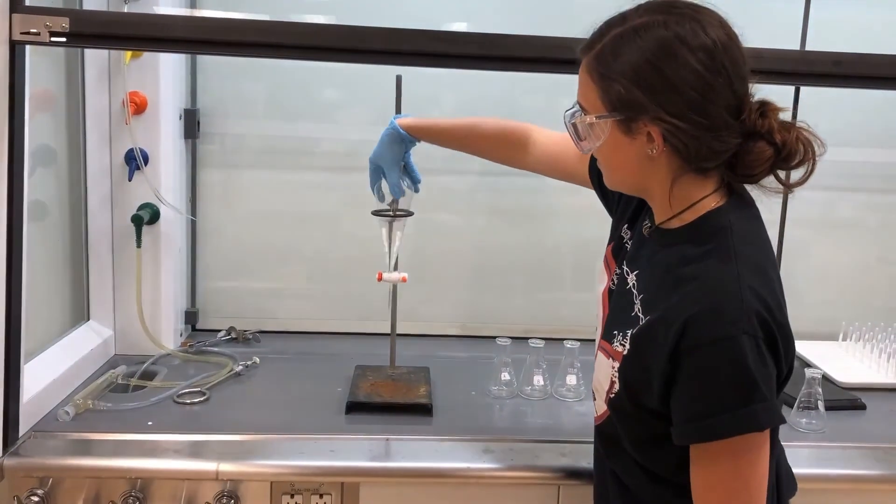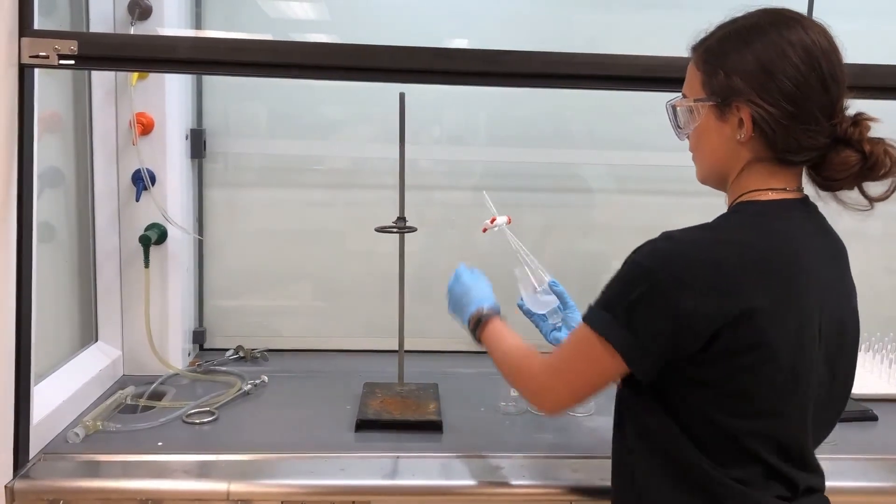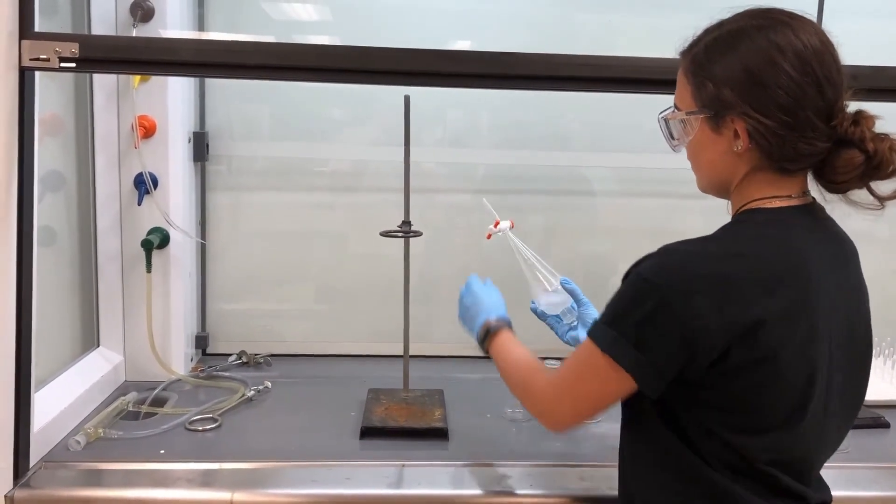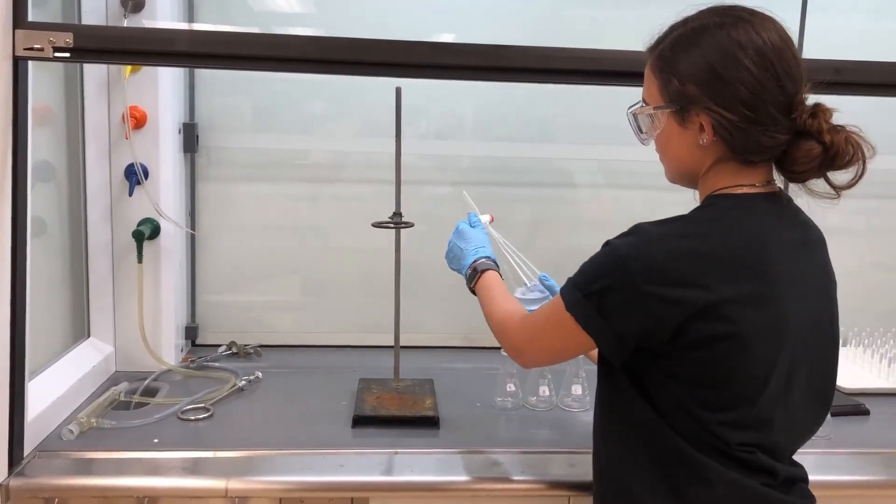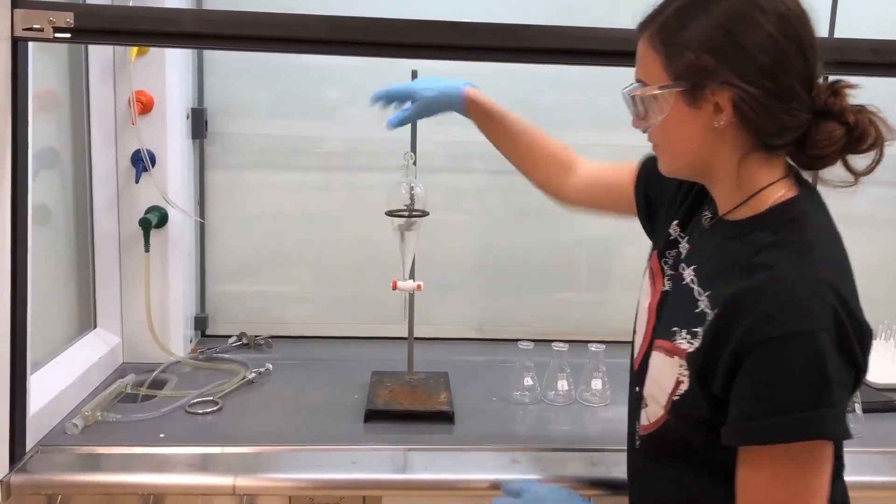To do this, you want to make sure that the cap of the sep funnel is at the palm of your hand and that the valve at the bottom of the sep funnel is closed. You then invert or shake the sep funnel like this a couple of times. To release the pressure, you must make sure that the nose of the sep funnel is facing away from you and is inside the hood. Once the pressure is released, place the sep funnel back on the metal ring clamp and wait for the layers to separate completely.